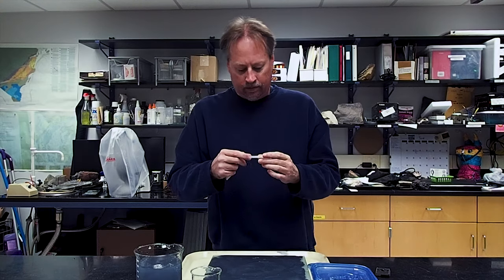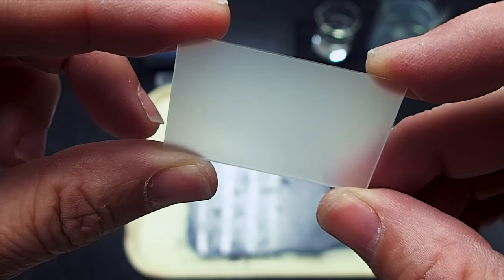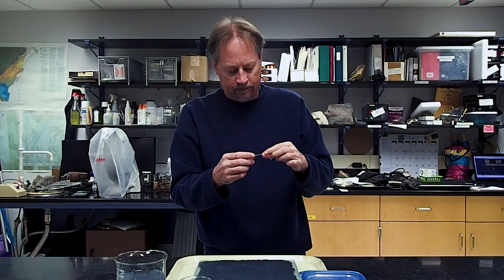Once all of your slides have been frosted and your chips have been polished with the 600 grit, you are ready to move on to the epoxying stage.